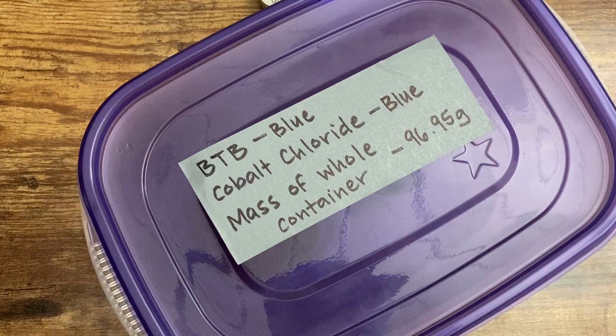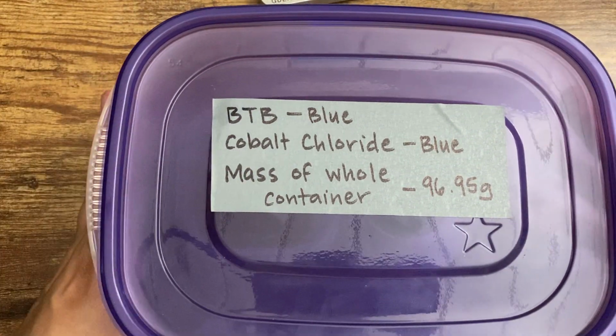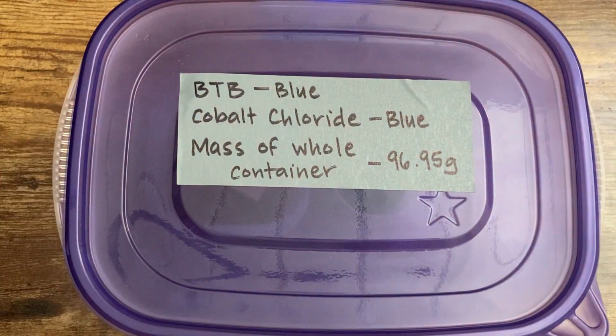All right, this whole container with my mealworms, the food, the BTB, and everything is now gonna sit on my desk for the next 2 days, and we'll come back and I'll check in with you then.